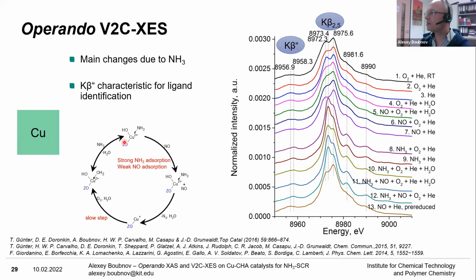But yes, I'm curious, what do you need to form this copper nitride? No, I'm just asking, in the fingerprinting and testing, whether you also considered that for the spectra that you tried to fit, considering copper nitride. As a materials chemist, we first of all think about this because I do know that copper and ammonia can have this kind of strong interaction at such temperature to form nitride. And there are actually some reference copper nitride compounds that you can buy to test. So I was just asking if you checked that that's not what you're forming.